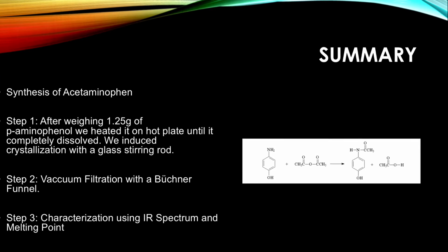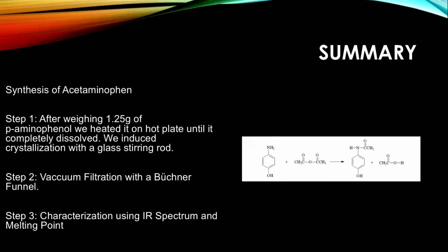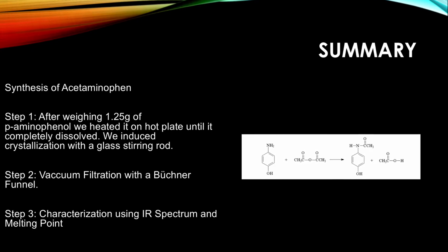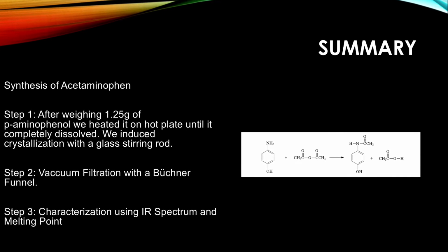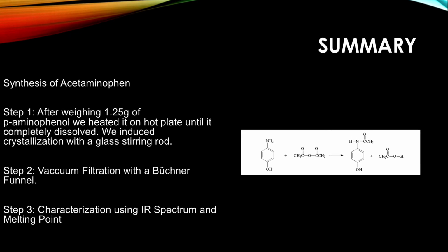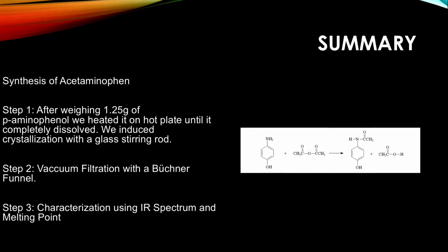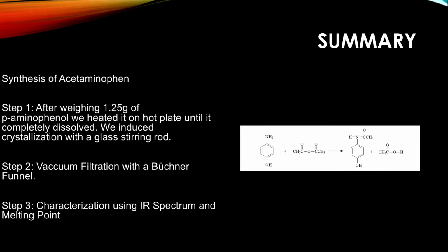The second step was a vacuum filtration with a Buchner funnel. Before filtrating with the Buchner funnel, I had to add a compound called Celite analytical filter aid, to add another layer to filter the decolorizing carbon, due to it being such a thin material.